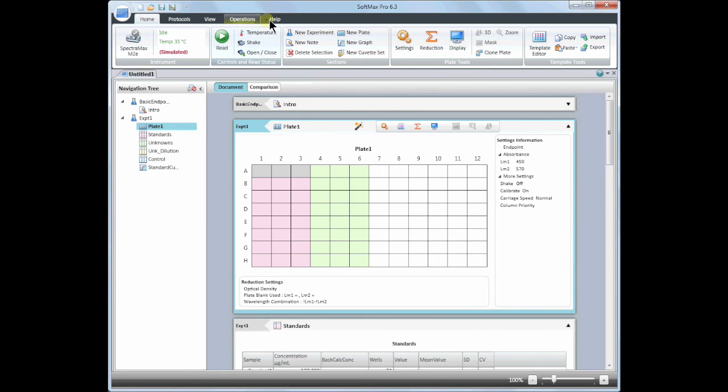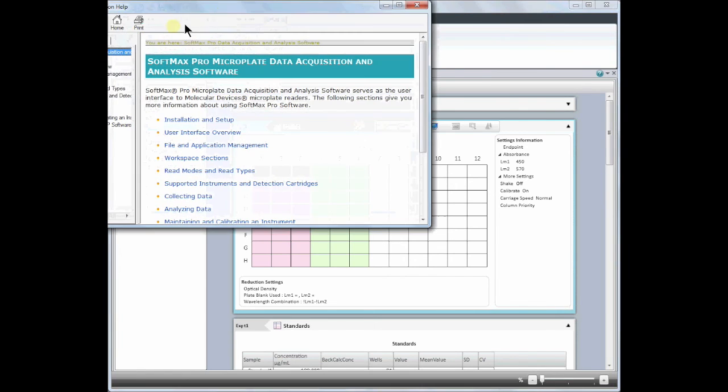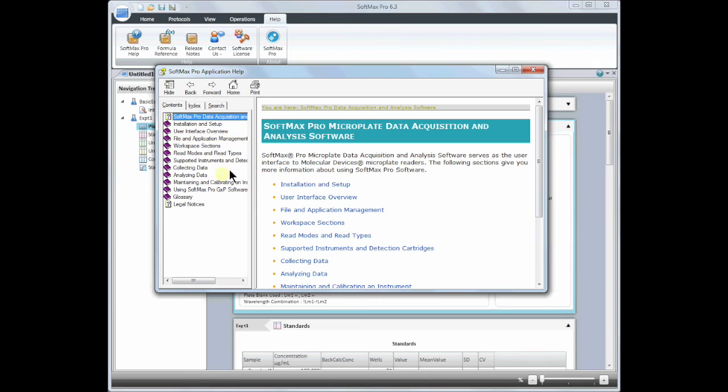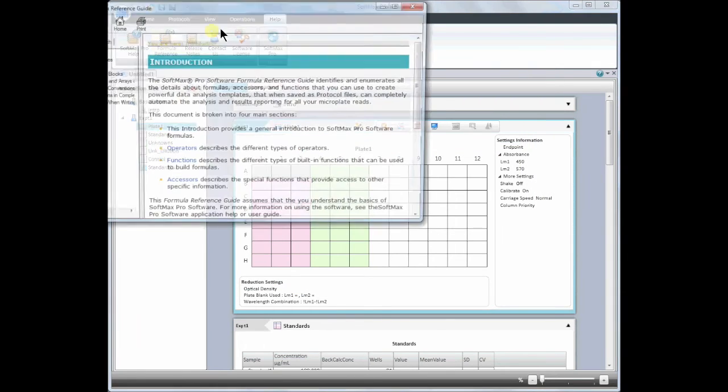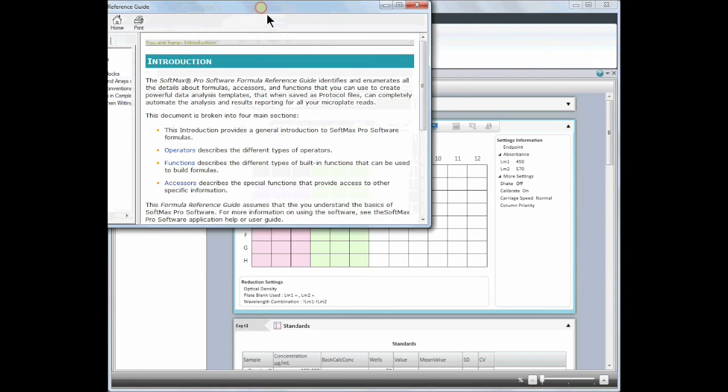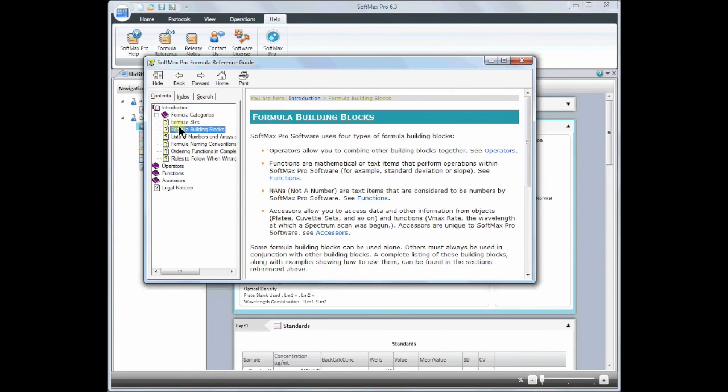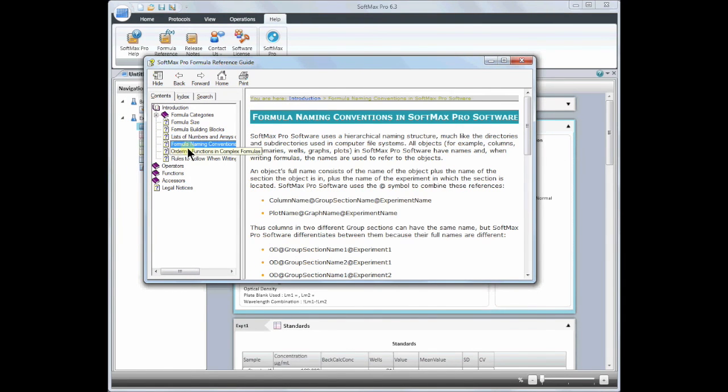For more information on SoftMax Pro, click on the Help tab and go to SoftMax Pro Help to access the Digital User Guide. The Formula Reference Guide contains all of the information needed to write custom formulas and learn the syntax of SoftMax Pro.